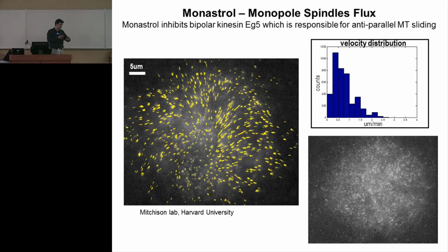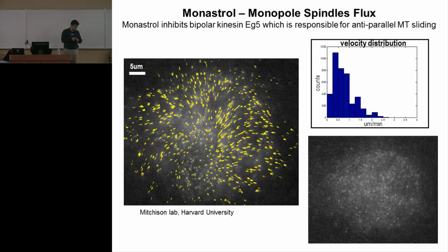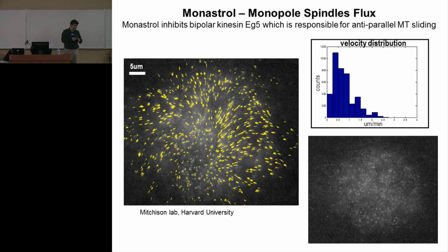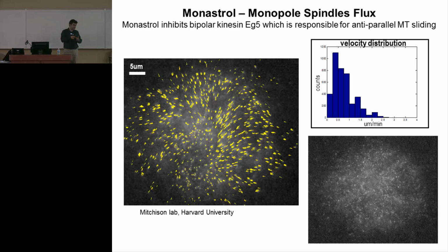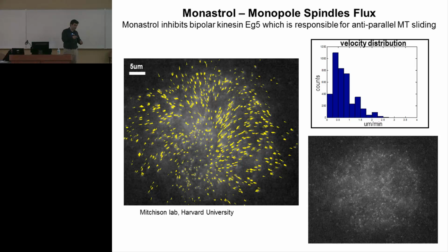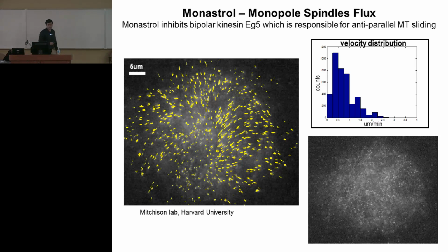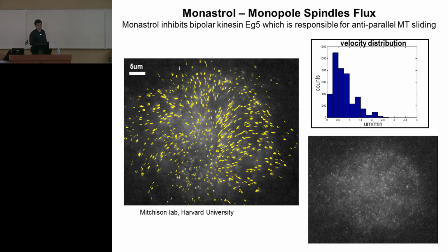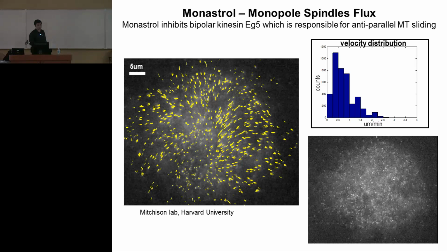In one pixel you need maybe 5 or 6 of those at the same time to pop up above noise. But if some of them leave, you lose the feature. So it's possible that the points in one frame are not exactly the same set of points in the next frame?